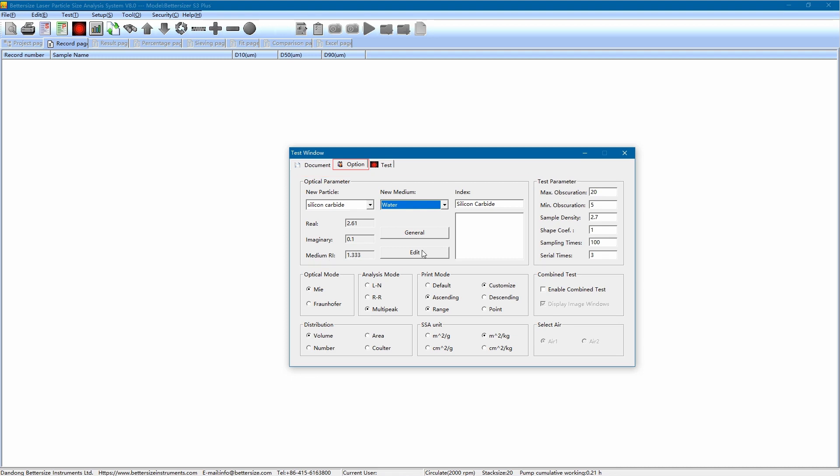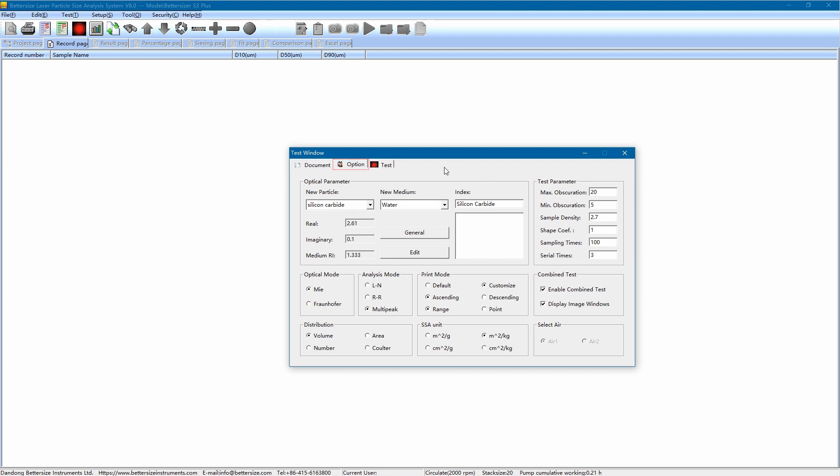As for test parameters, we can just use the default parameters for this measurement. And finally, remember to click on the enable combine test button in order to perform the combined test. Up till now, we finish the parameters input. Let's click on the test tab for the actual operation.